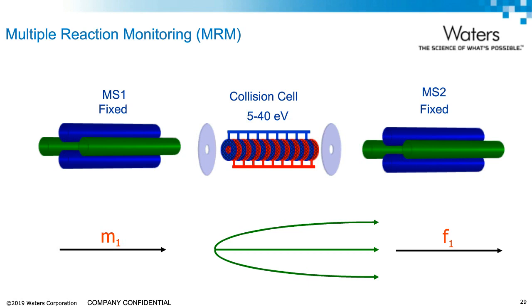In the experiment shown here, both quadrupoles only allow transmission of the specific precursor ion that provides the specific product ion for monitoring. MRM is the most selective and sensitive mode because only a specific ion which fragments to produce a specific fragment ion is monitored for the entire data acquisition time cycle rather than a portion of the cycle in the case of a full scan.